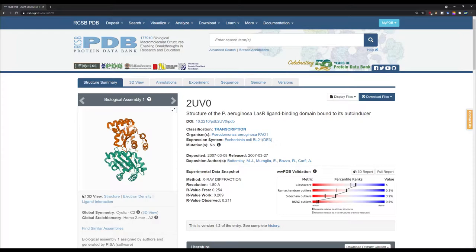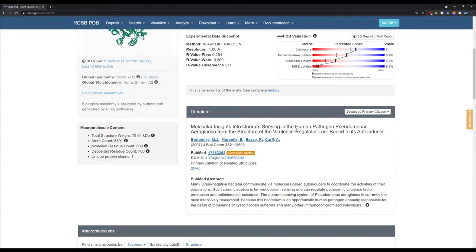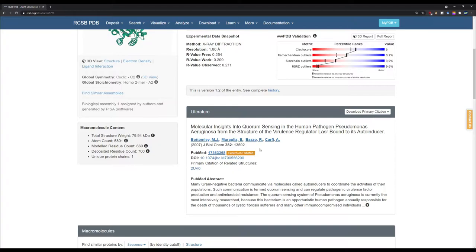You want to know where the ligand binding pocket is. I'm going to take the example of the LAS-R molecule, which is the receptor for a quorum sensing signal molecule. Pseudomonas aeruginosa utilizes quorum sensing to regulate the function of various genes. To understand where the ligand is bound and what amino acids are present in close proximity to that ligand, we need to export this structure to the PyMOL software. I want to mention the publication for this particular structure — if you are using it, you should always refer to the publication.